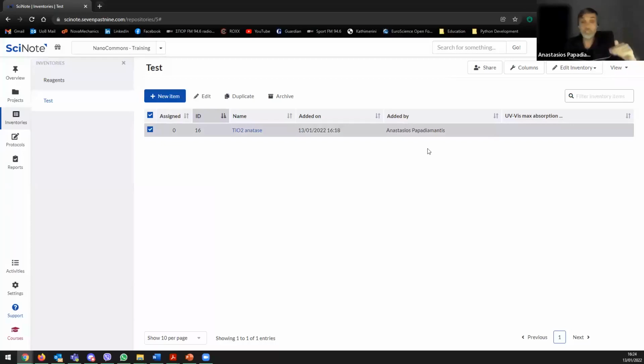The caveat is that if you want to import a specific template, until now, you have to add the columns first, and then you can upload the template with all the samples that you want to analyze, or data that you created in the past, and it will automatically fill the columns.